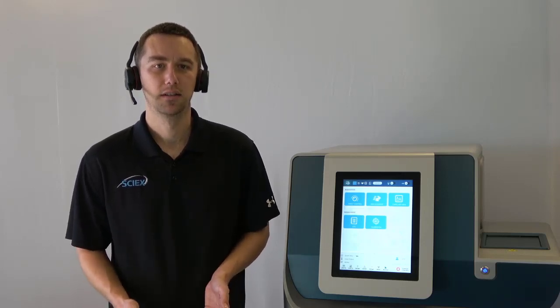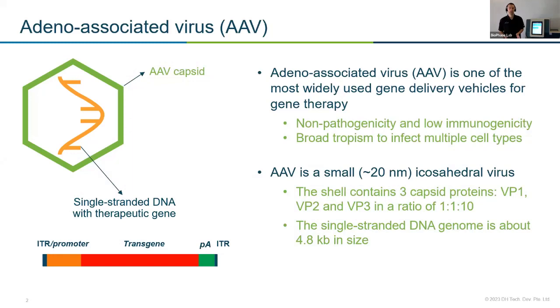So let's start by taking a few minutes to review the background and the analytical characteristics of AAVs. And we'll also overview the CE-SDS method in general for AAV protein characterization.